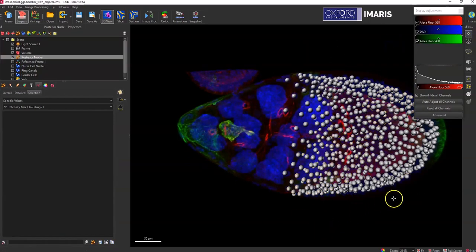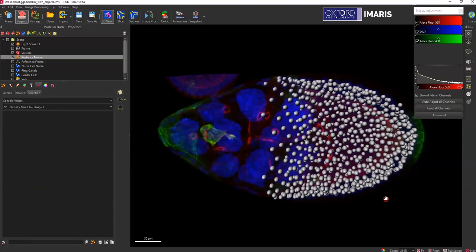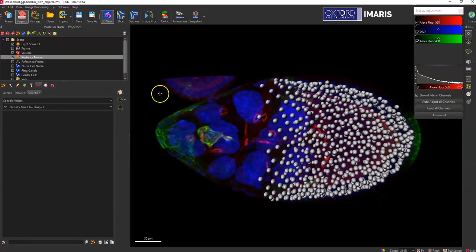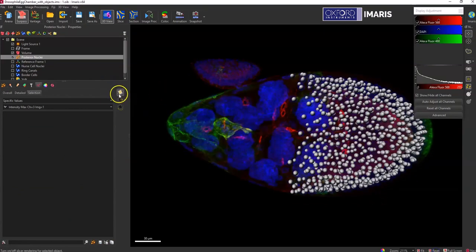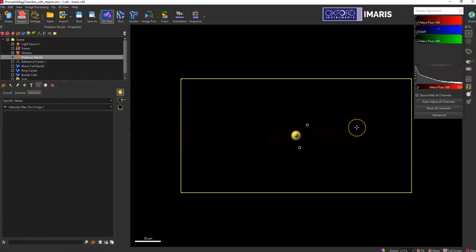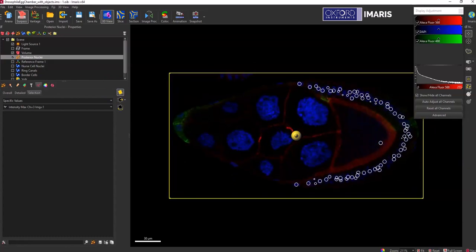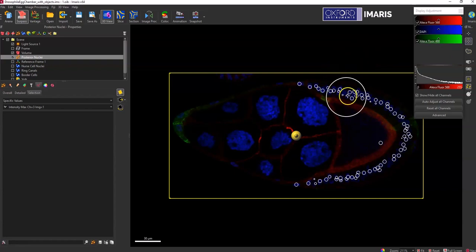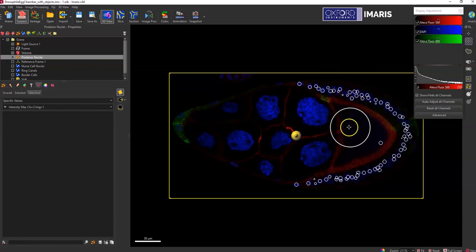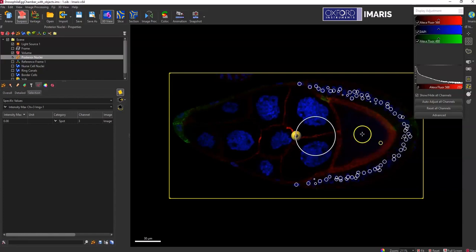So if I wanted just to do a single Z plane, I can switch instead of being in the volume rendering, I can switch to the slicer rendering. And I can go in here and I'm still going to be in the circle selection tool and then I can click right here and see only one object was placed here.